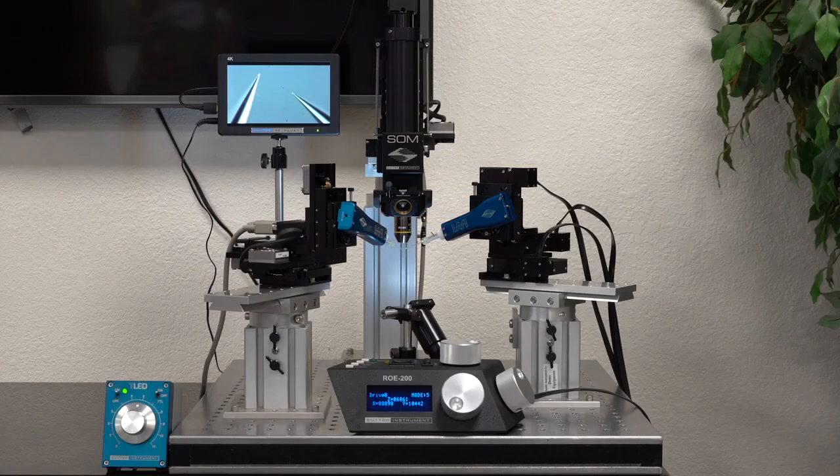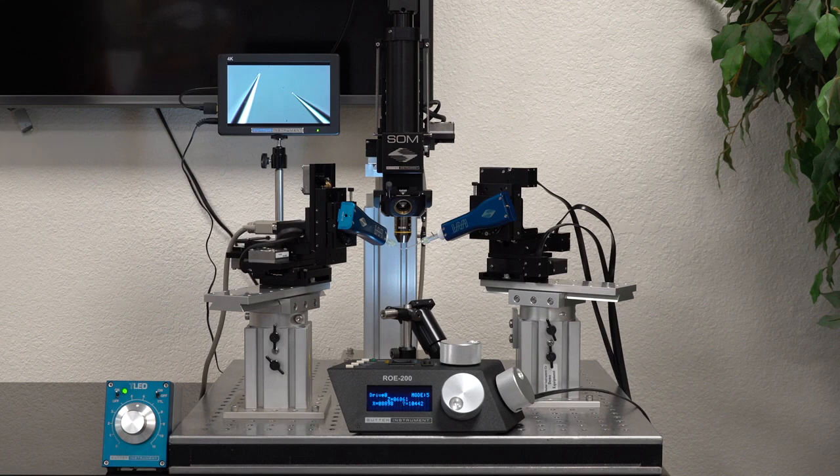We developed the SOM in collaboration with a group at Berkeley. They used our two-photon MOM microscopes and wanted a simpler microscope with the same XYZ motorized positioning of the objective.